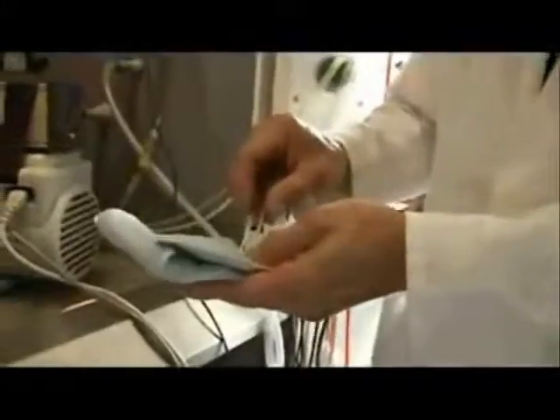So here we have the dried lithium, which you can see, this is metal, and we're going to drop it into the water and see what happens. And it'll fizz around a little bit. So you see the lithium reacting quite rapidly with the water, and you can see hydrogen gas being evolved.